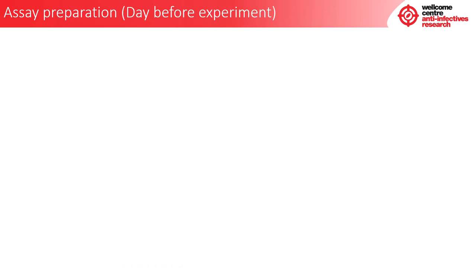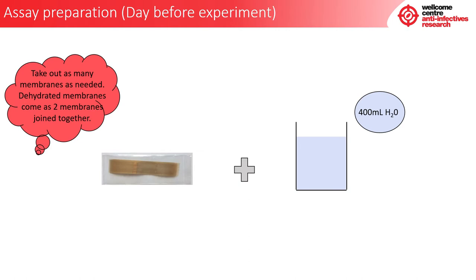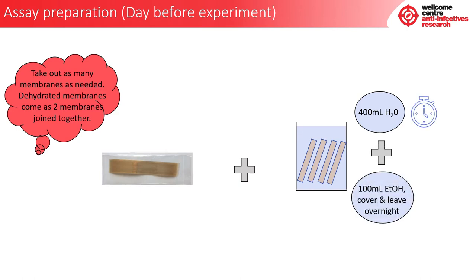As mentioned previously, dehydrated membranes need to be hydrated prior to use. This is recommended to be done the day before your experiment. For this, you will need your membranes and a beaker. Fill the beaker with 400 ml of deionised water, then take out as many membranes as needed. Dehydrated membranes come as two membranes joined together; therefore, for a whole 96-well dialysis block, you will need eight membranes in total, so take out four of the joined-together membranes. Put these in your water and leave on the bench for an hour. After this hour, add 100 ml of ethanol, cover the beaker, and leave overnight in the fridge.